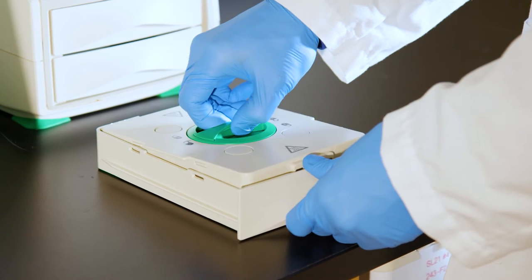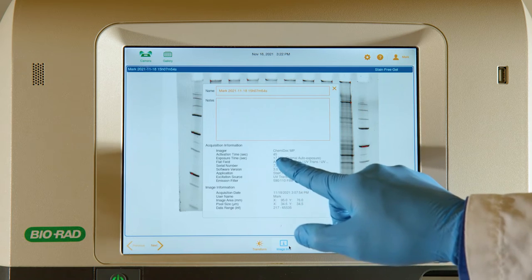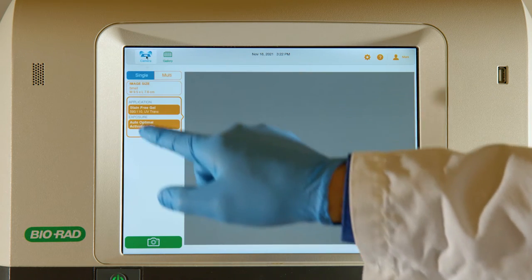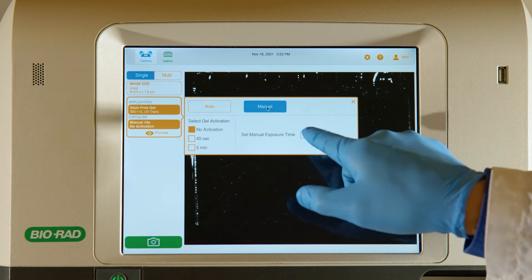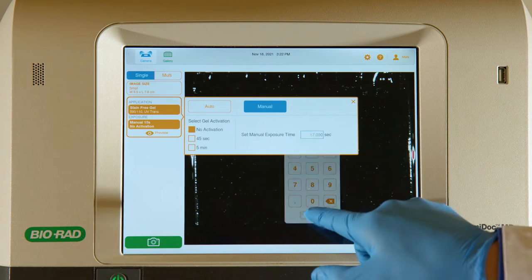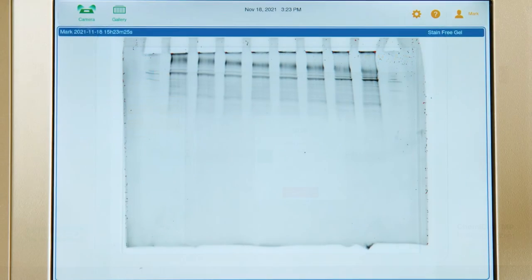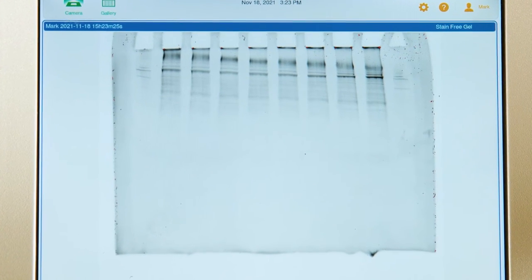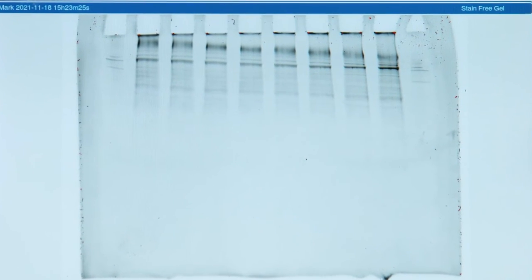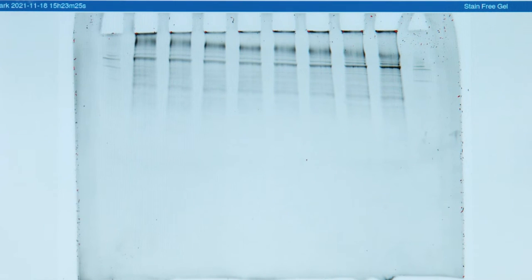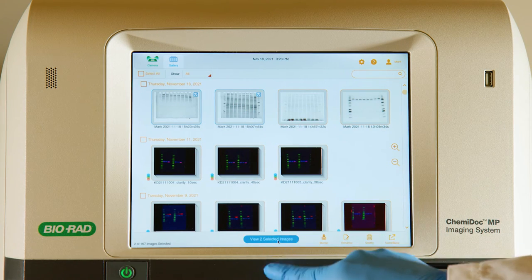After completing Western transfer, retain and image the gel. When imaging, use the same exposure time as was used to image the gel prior to Western transfer. The system's auto contrast algorithms will attempt to highlight any signal even if there is very little protein left in the gel after transfer. For a fair comparison of the pre and post transfer gels, use the same contrast settings on both images.